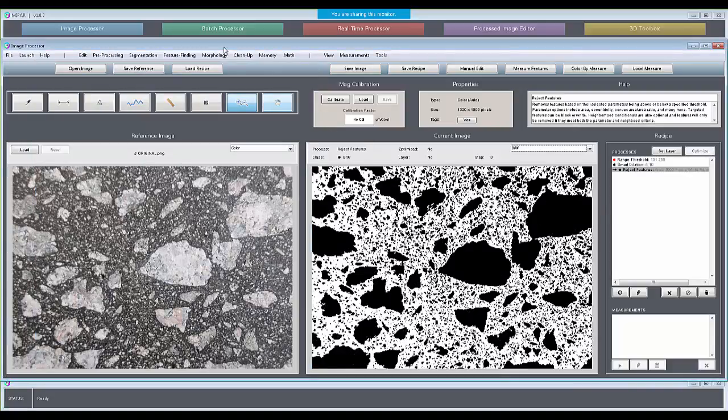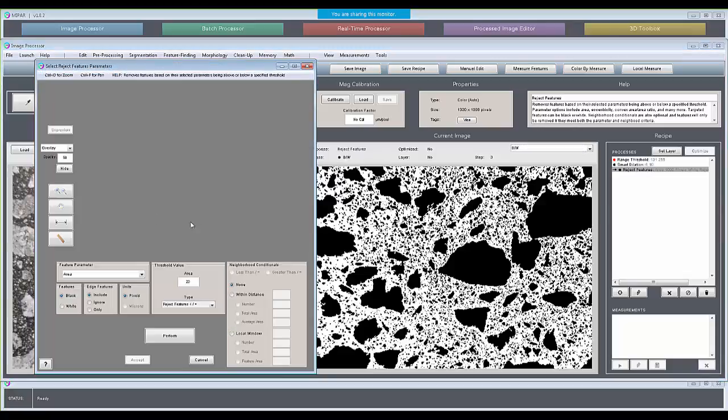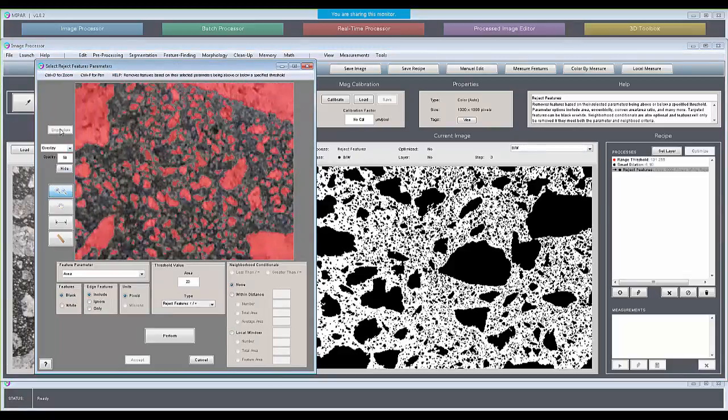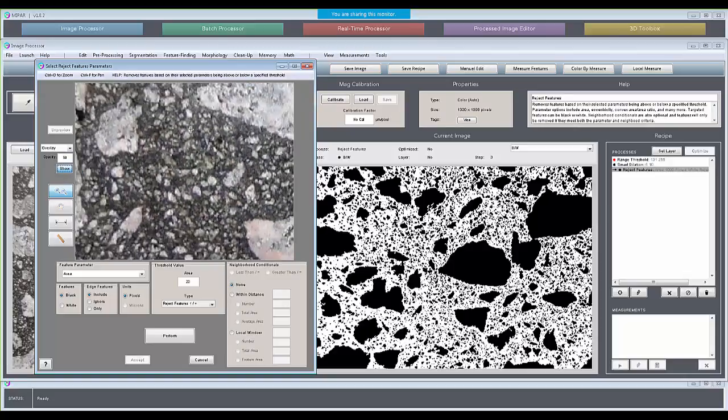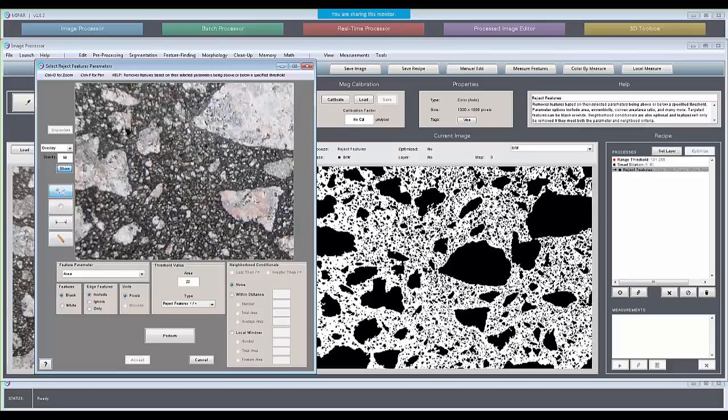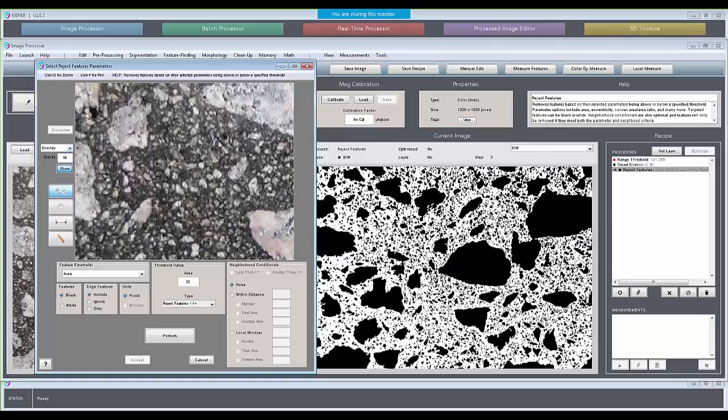And then what we're going to do is get rid of small ones. Doesn't really matter what we pick here. We're just trying to target ones that are not nicely found with a global threshold, because you've got such a refined particle dispersion in here that's got varying contrast. This calls for an adaptive threshold kind of an approach. We'll save the global for the big ones, and then we'll target the small ones with the adaptive.